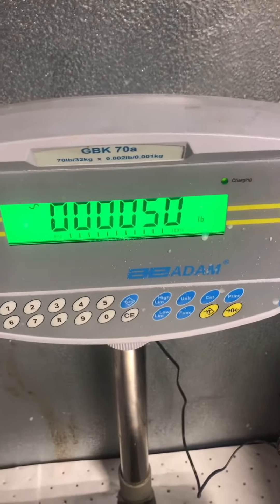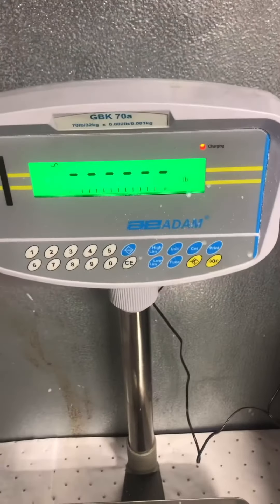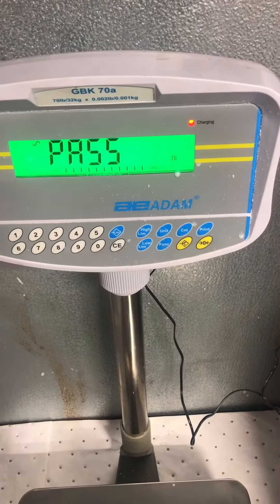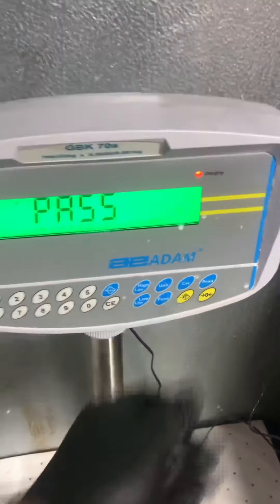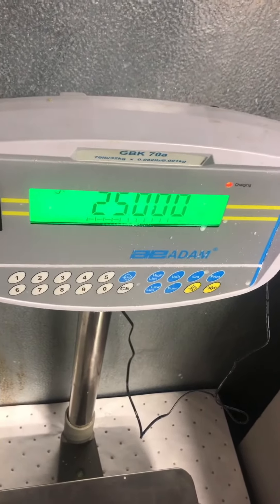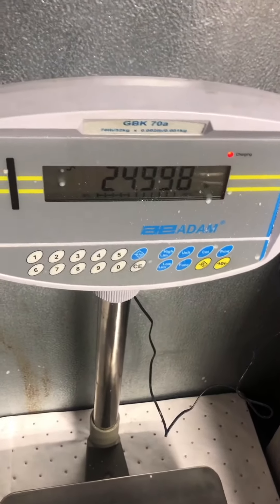It says load — load 50 — put it on, wait for the squiggly line, press tare. Pass. That's how you adjust the calibration with the Adam GBK.